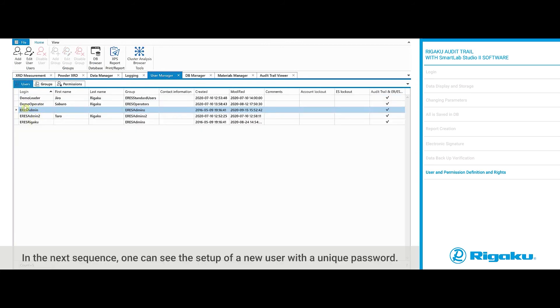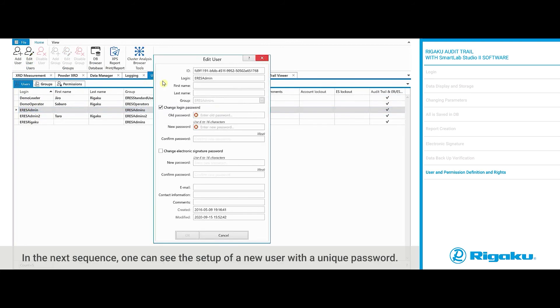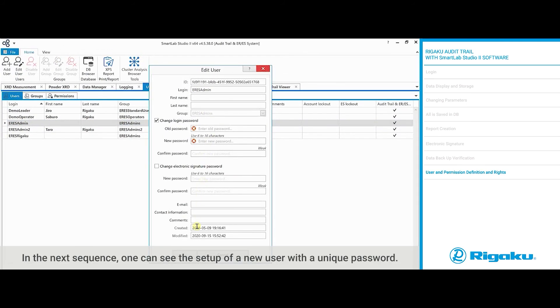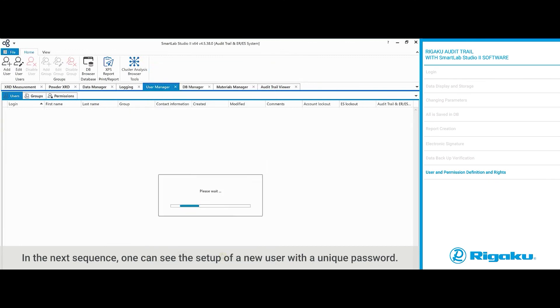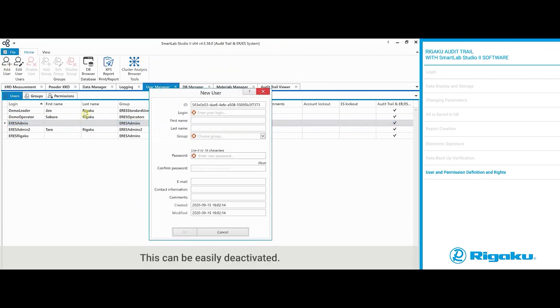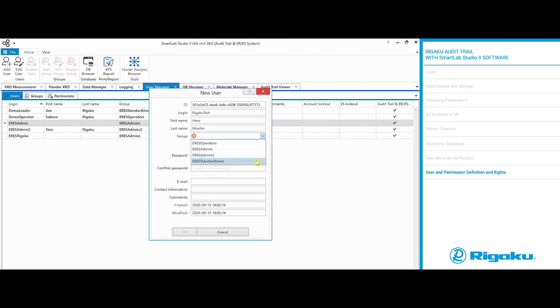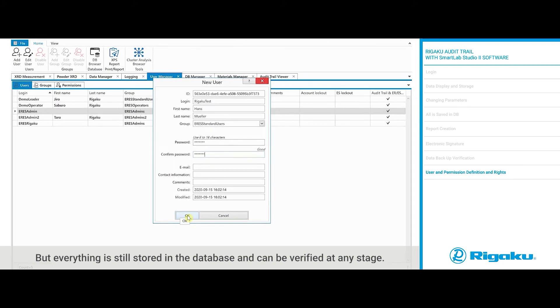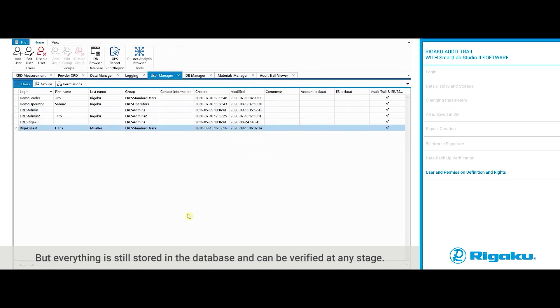In the next sequence, one can see the setup of a new user with a unique password. This can be easily deactivated. But everything is still stored in the database and can be verified at any stage.